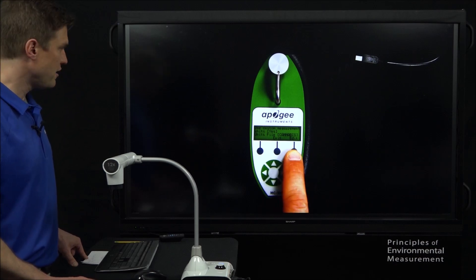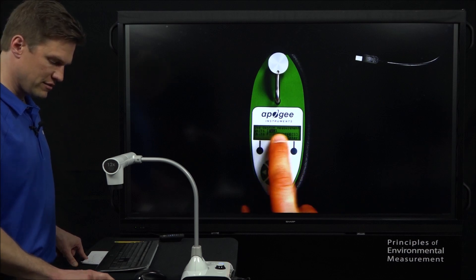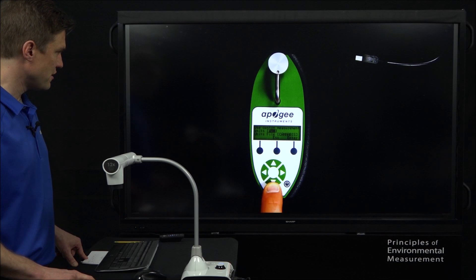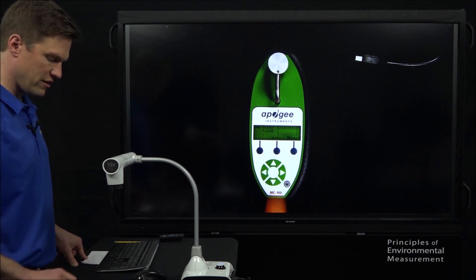At this point, we hit edit. And this highlights this units. It says yes. I think you can make it say no, but we want to say yes. You can make it say yes and no by hitting up and down. So now that we have yes highlighted, we hit the right arrow.